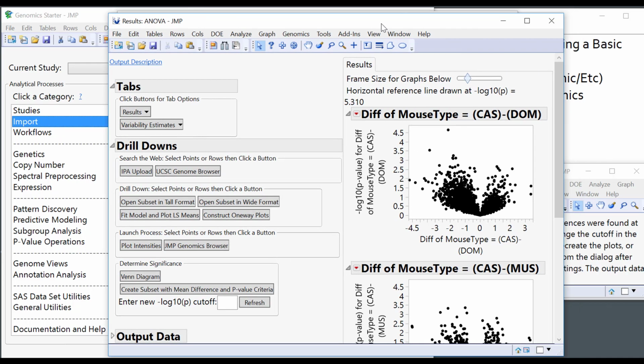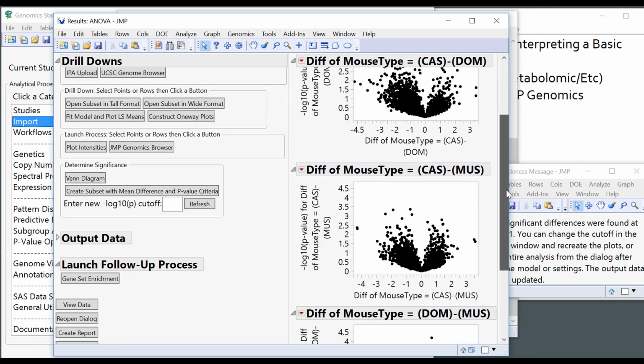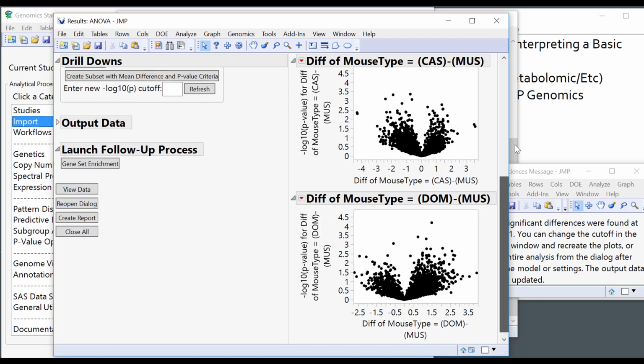And this was the whole goal. So hooray, we've reached the end, but now what do we do with this? So now we're getting automatically some volcano plots, and in these volcano plots, we should be able to see which markers give us a statistically significant difference.